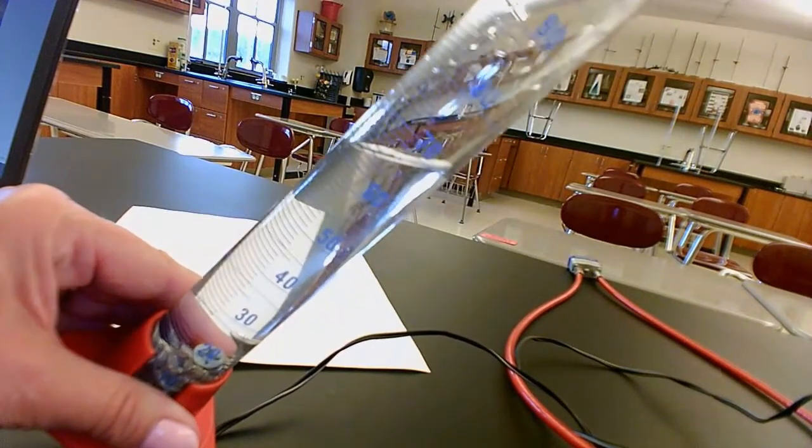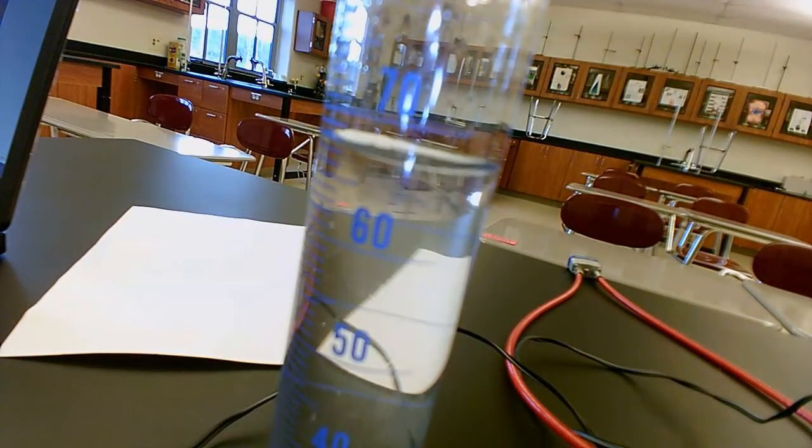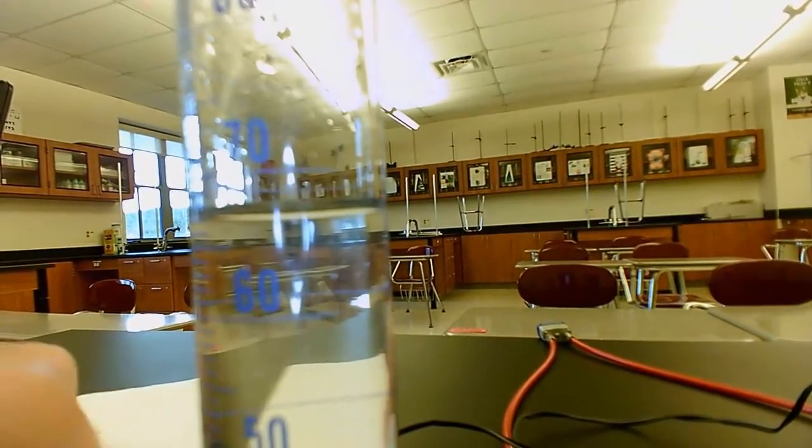Okay, now we have a second volume to record. We're using water displacement to figure out the volume of the screws.